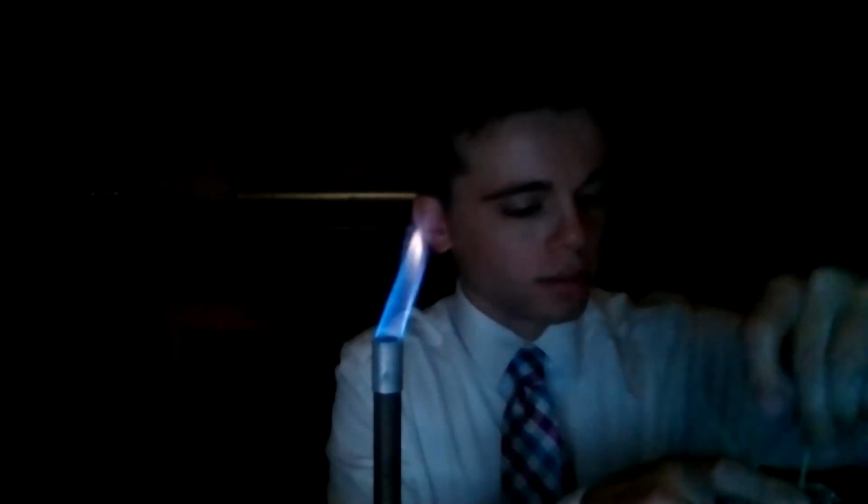Okay. We wanted to do potassium next, right? Oh, we got a lot of potassium on this one. Ooh.